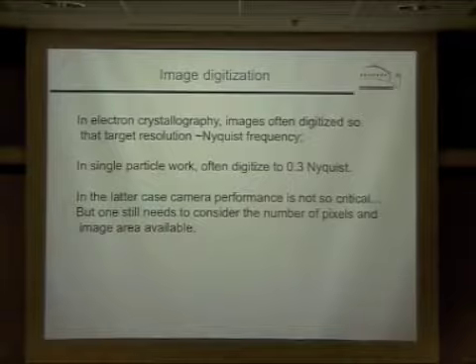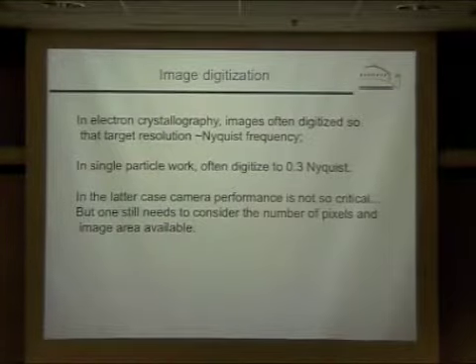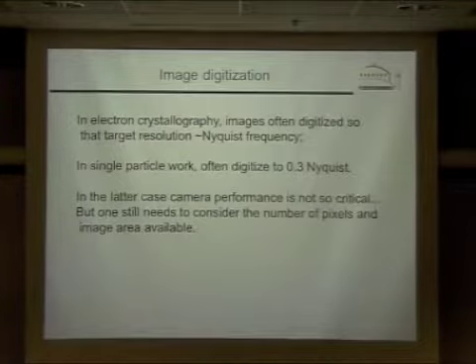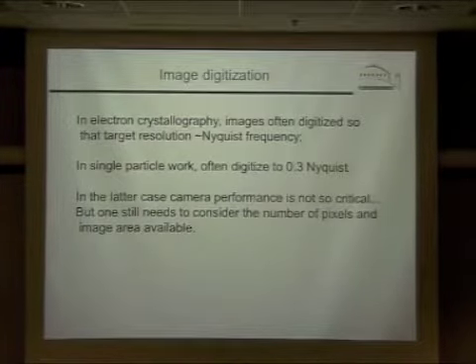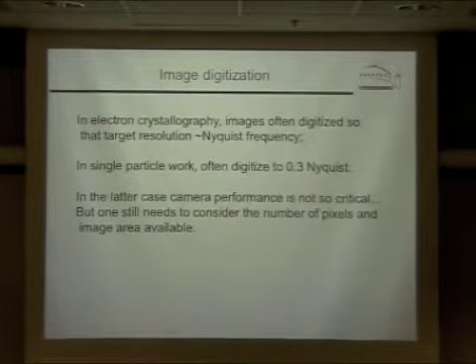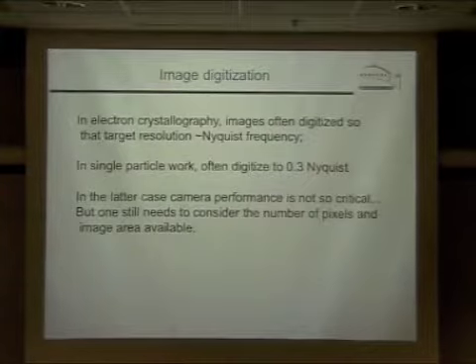The habit seems to have developed, though, with people working on single particle projects, to digitize so that they're using a very small fraction of the spatial frequency available. Maybe a third of the Nyquist frequency, I think sometimes even a fifth of the Nyquist.